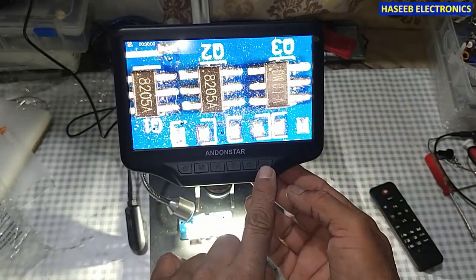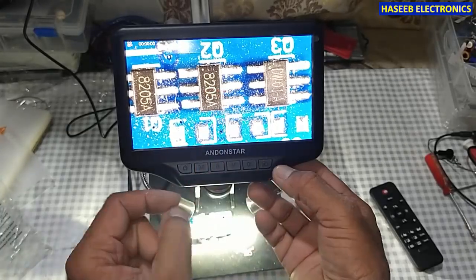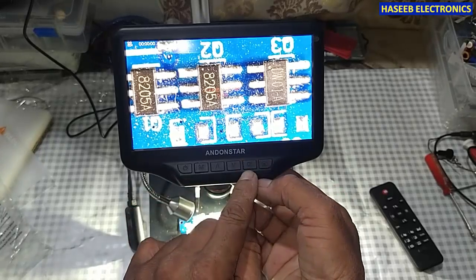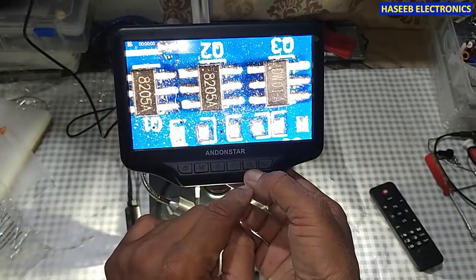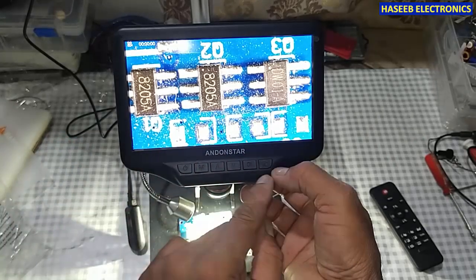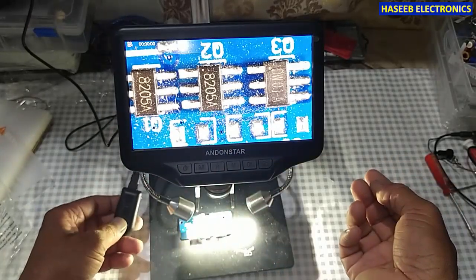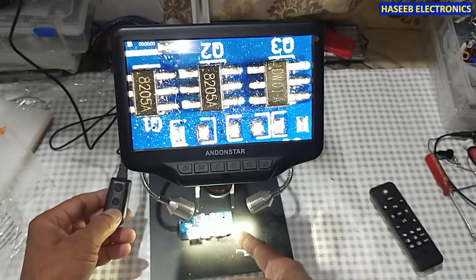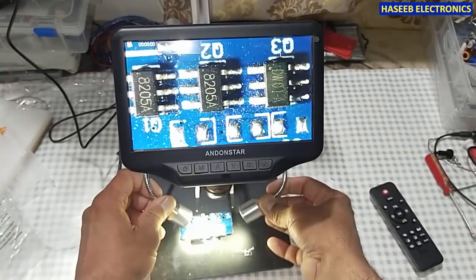Now we can use this remote control to take pictures and select functions. Here we have the camera function — if I press this button it will display 'please insert memory card.' If I press OK it will start to record video, but it needs a memory card inserted. It will capture the screen and save as an image. We can also adjust the brightness of the LED lights to get a clear image.